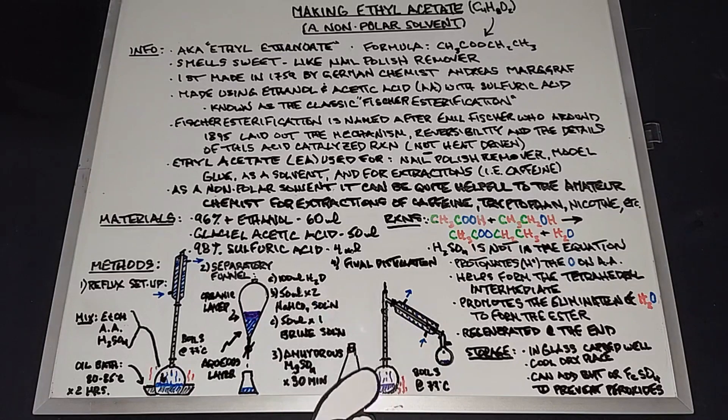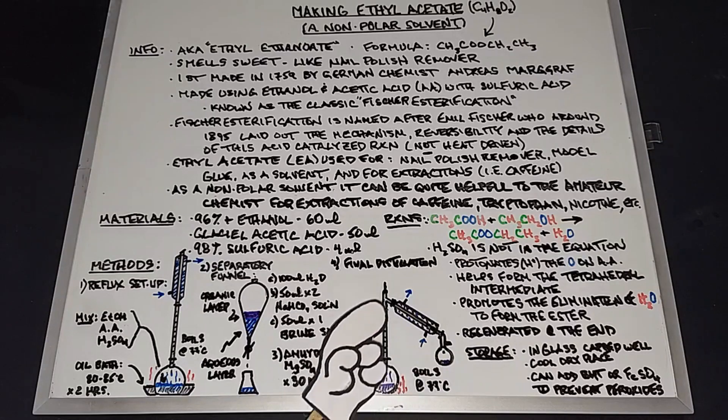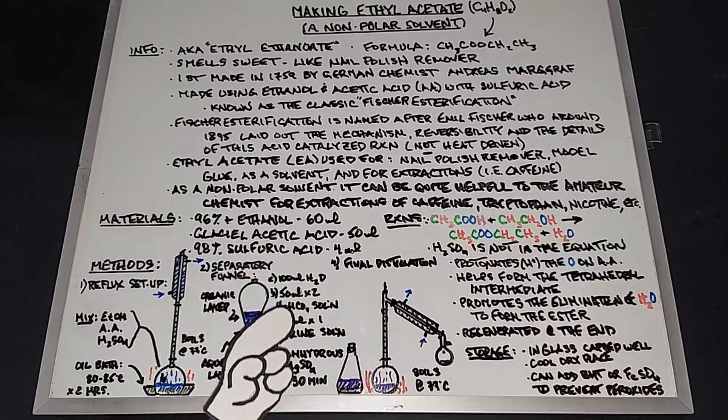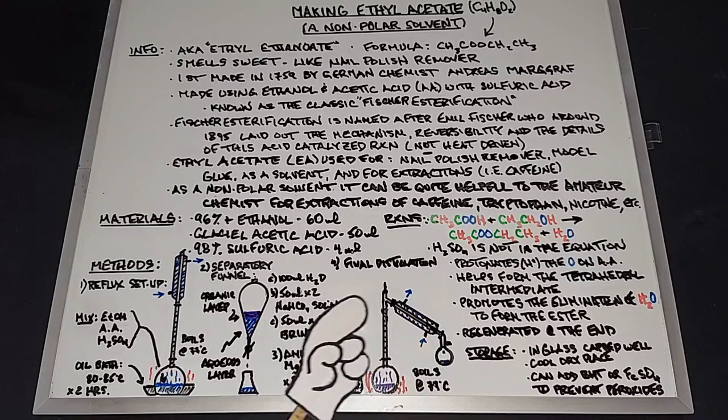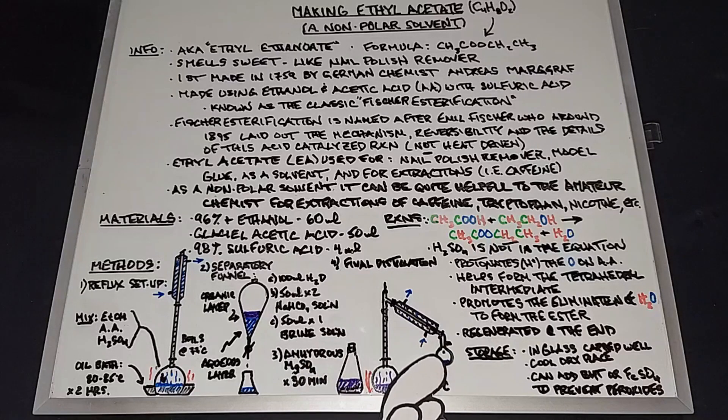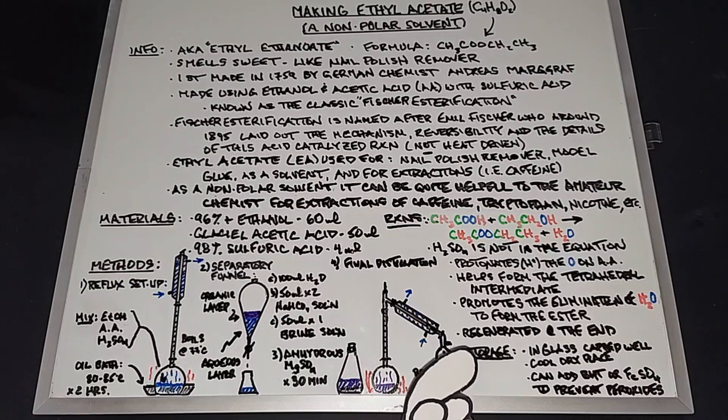Then we're going to pour the ethyl acetate into a round bottom flask and perform a regular fractional distillation. It'll boil at 77 degrees like before. What it will leave behind are any of these things: the sodium bicarb or salt, or even some of the mag sulfate that might've snuck through. Plus hopefully any water that might be left. When we fractionally distill this, what we'll get is some really pretty pure ethyl acetate.